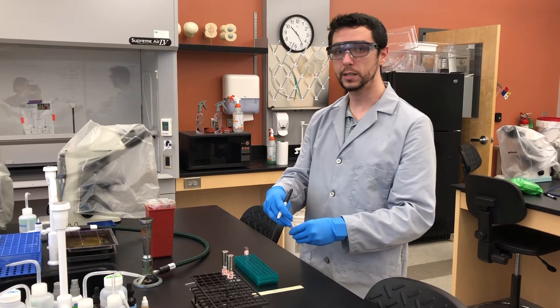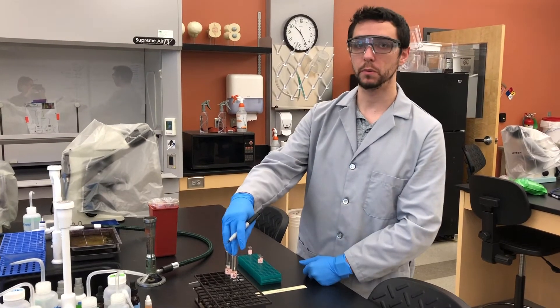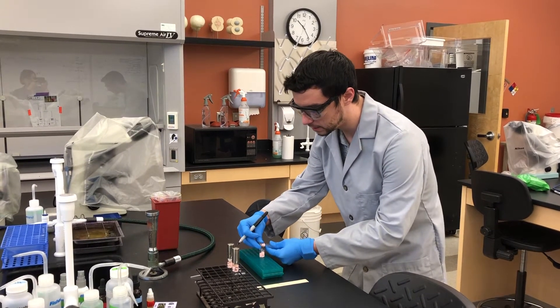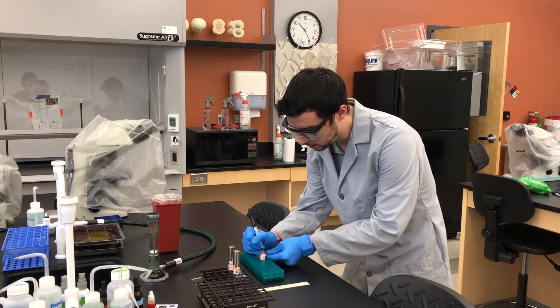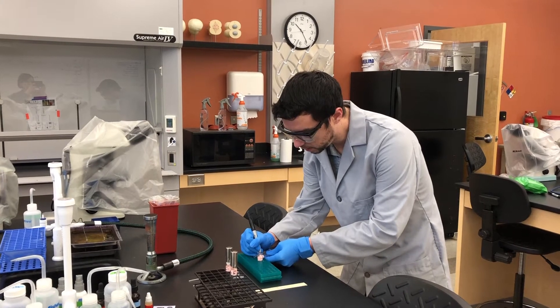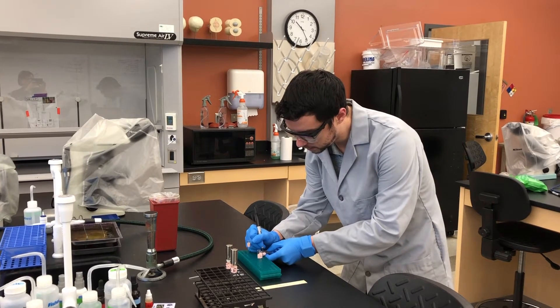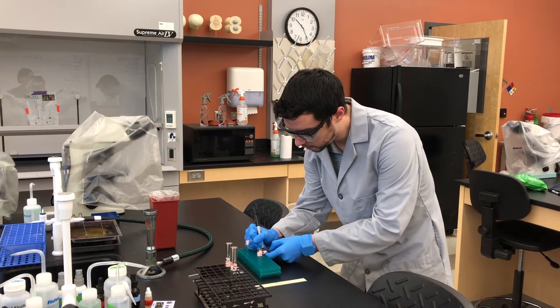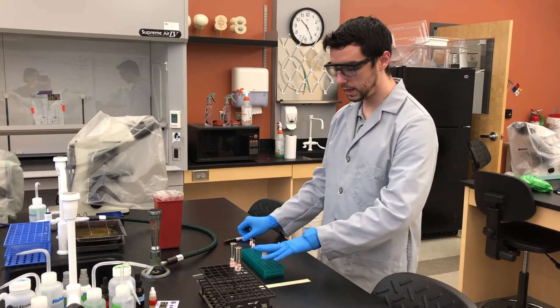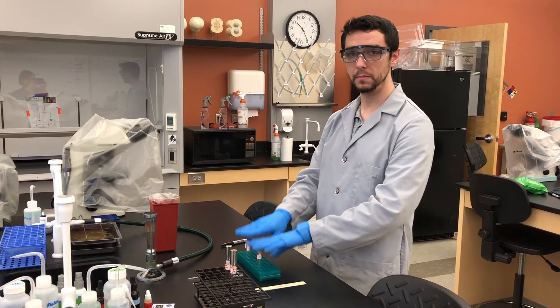Even though we call these the MRVP tests, they are two separate tests that happen to be done in the same growth medium — that is why they are paired. We will also label EC VP and EC MR. Notice I have kept my EA tubes separate from my EC tubes to make sure I do not risk mixing them up.